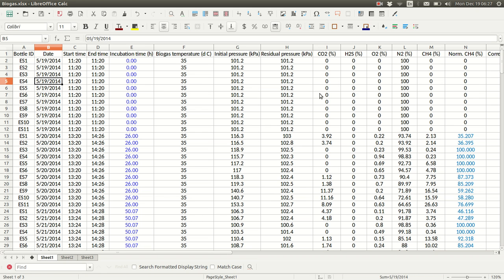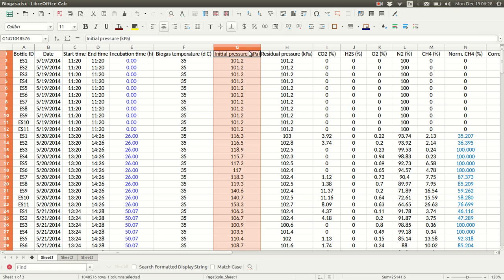In this video, I'll show how to use OBA, the online biogas app, to calculate BMP from manometric measurements of biogas production. We will need two data files to do this. In the first one, which I've called biogas, we have our measurements of biogas quantity. Here it's headspace pressure in each individual bottle that contains substrate and inoculum, or inoculum only.